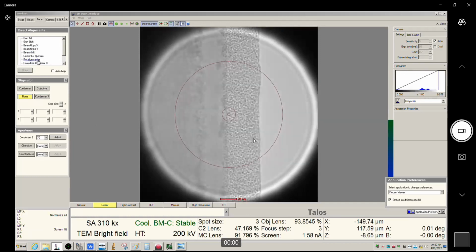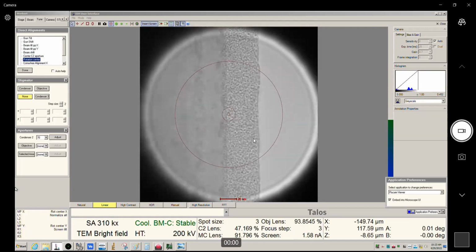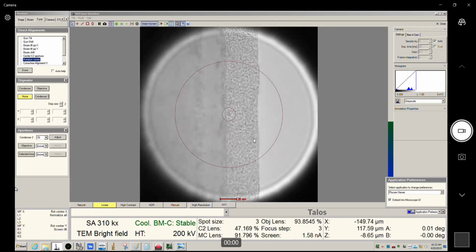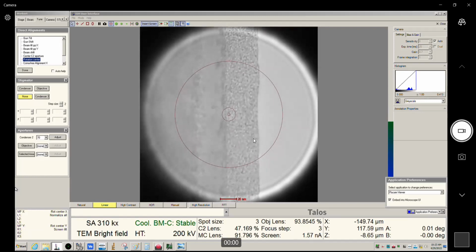Now if I go to rotation center, your multifunction knobs are controlling what's called beam tilt. It says rotation center, but that's really what this is. If I pick one of the multifunction knobs, watch what happens when I turn it. The beam is tilting, but it's not moving, because I established the pivot points properly. You can see what's happening to the image. As I go far away from normal, I end up with a blurry, crappy looking picture.